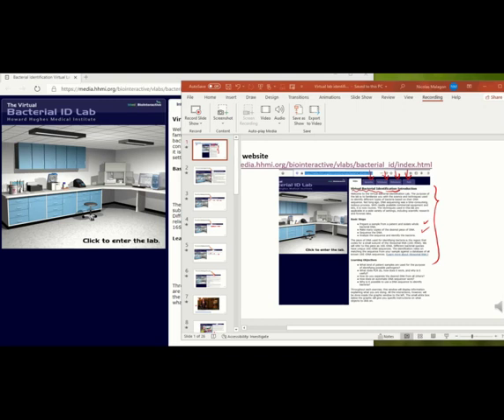Okay, this is the long version, the long video tutorial of how to do that. And you don't have to watch it. I'm just going to go step by step in case you have a doubt about how to do something.